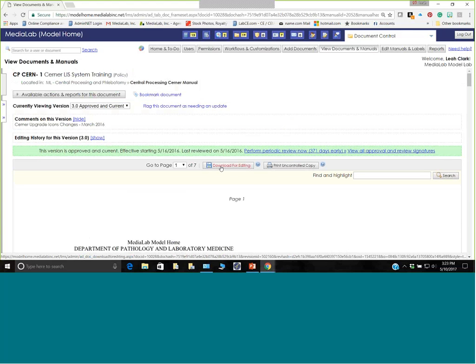There's actually two ways that we handle editing. One of them is to do your edits in Microsoft Word. So if your document came into the system, let's say in Microsoft Word, and most of them do, you would get a copy of that document back. You could turn on track changes in Word and make your revisions. And MediaLab will actually support those red lines and will show them with a nice little button to click them on and off once they're back in the system with us. And then the last step, obviously, is uploading that revised document back to MediaLab.